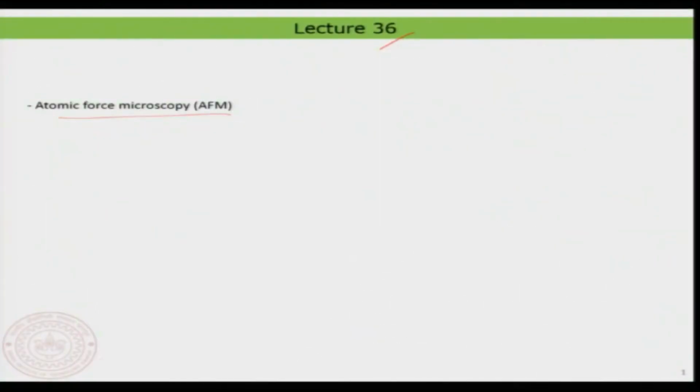Atomic force microscope is a similar class of microscope like the scanning probe microscope or the scanning tunneling microscope. So, in this lecture, we will try to look into the technical aspect of this microscope and what we really measure in greater detail, and then through this couple of lectures I will also be showing a few examples that you can also study using atomic force microscope.